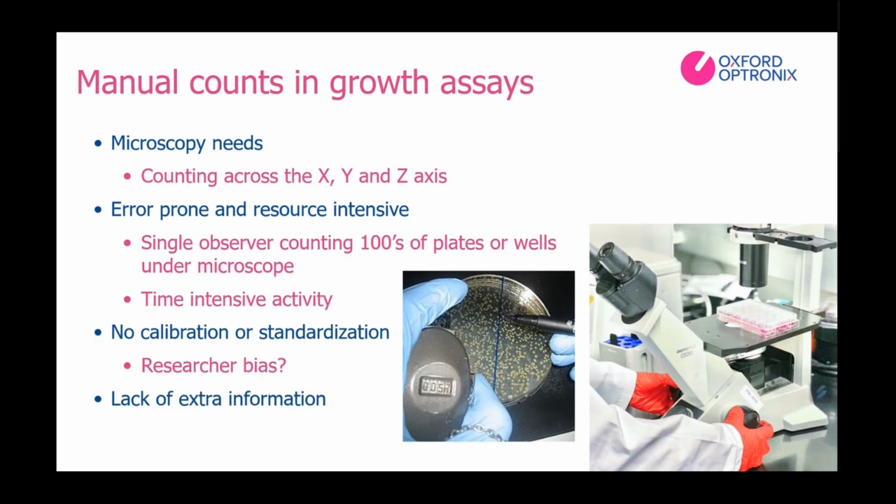The use of bright field microscopy to visually count organoids offers a major problem for researchers, which is it is often difficult to determine the acceptable organoid size across different samples. If an organoid is on the borderline of being counted, is it counted or not?